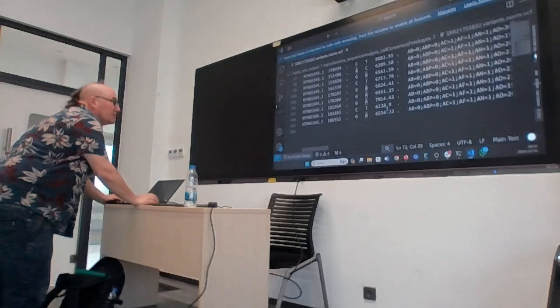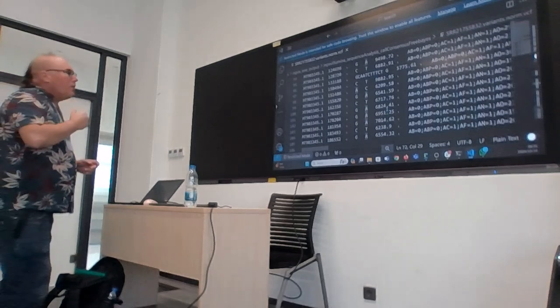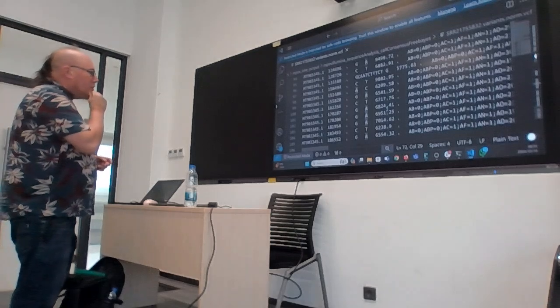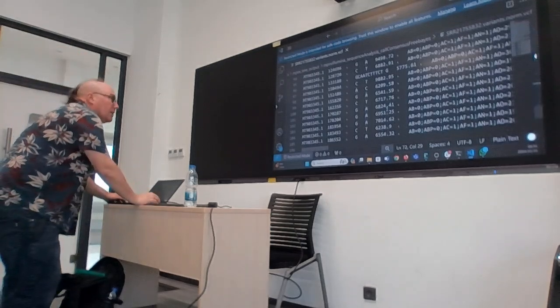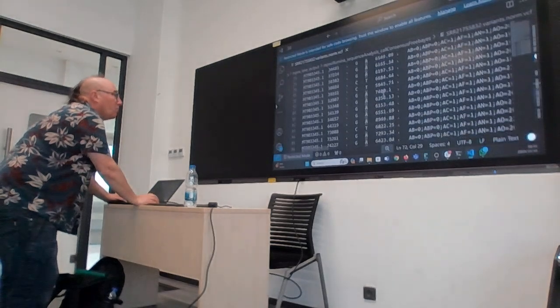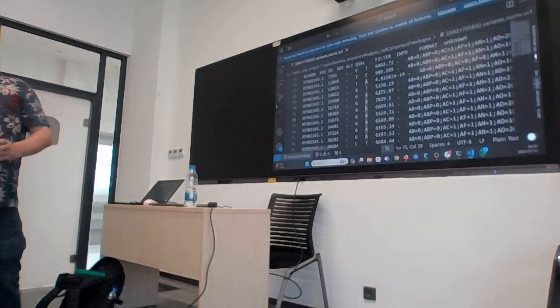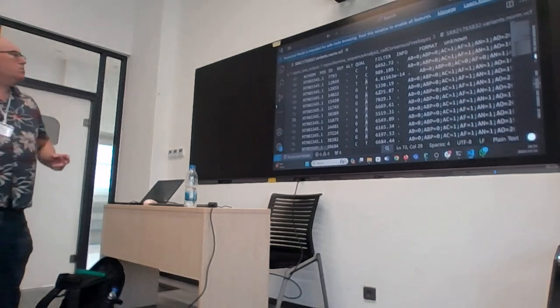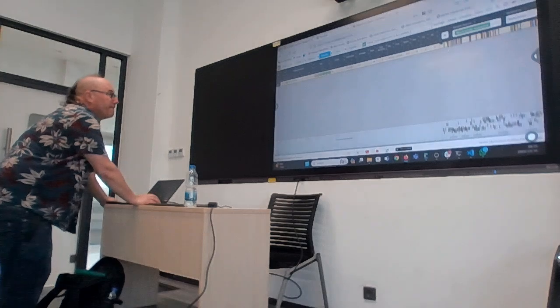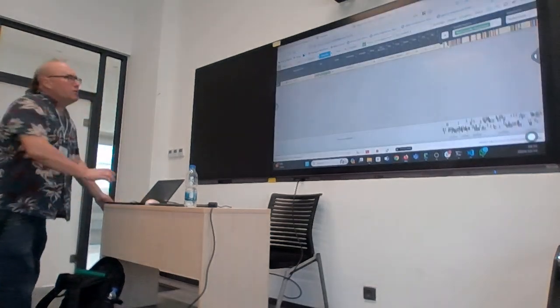The coordinates are not the same because the reference is not the same. So it's not easy to show here. Let me try another example. Okay. You know what? I'll show it the other way around.